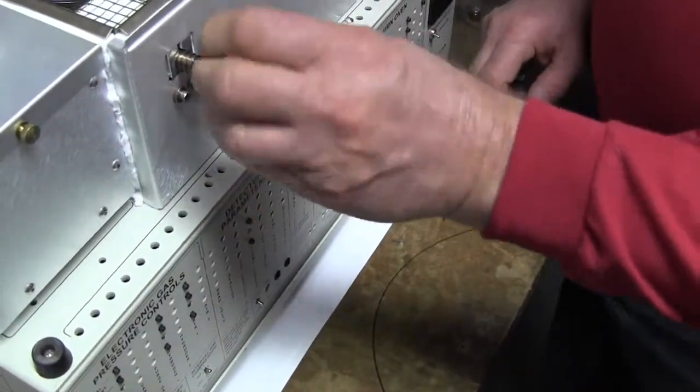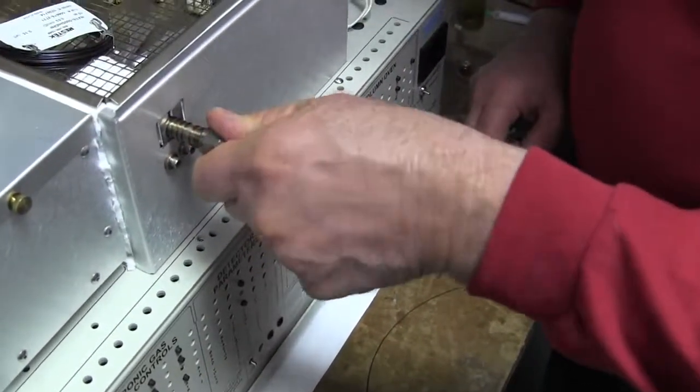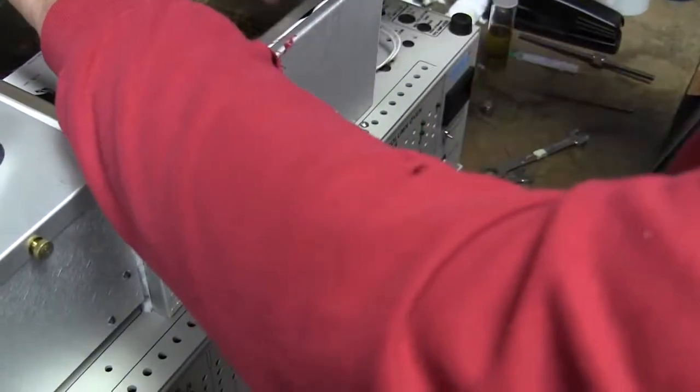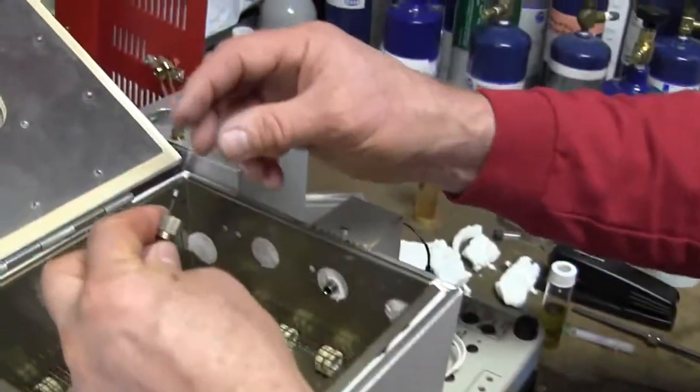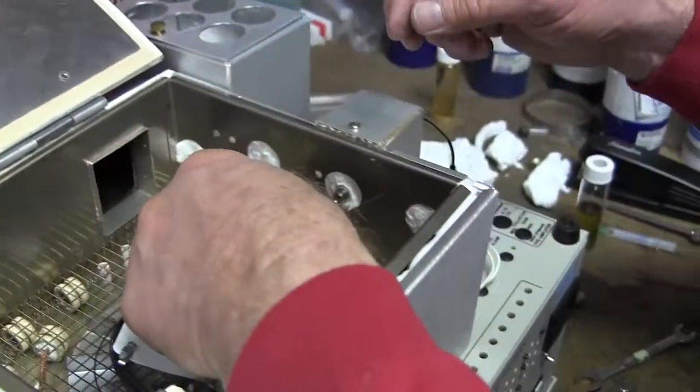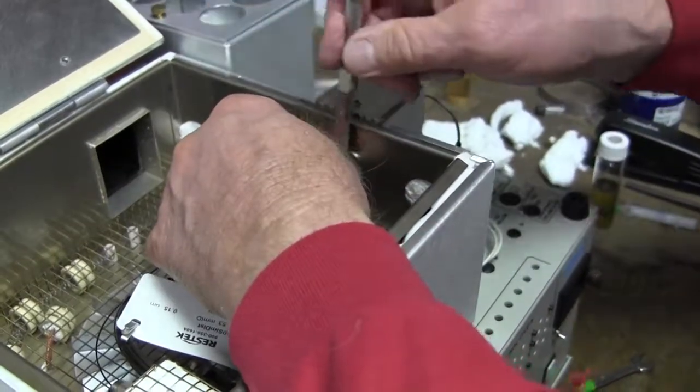Now to put the column back in the FID detector, ensure that the column is sticking out about an inch from the ferrule and then reinsert and tighten the nut. That's all there is to it.